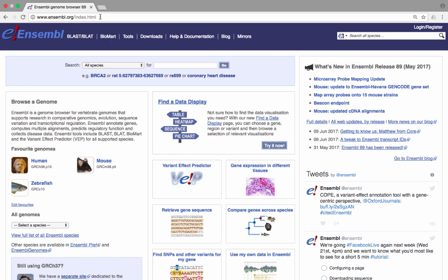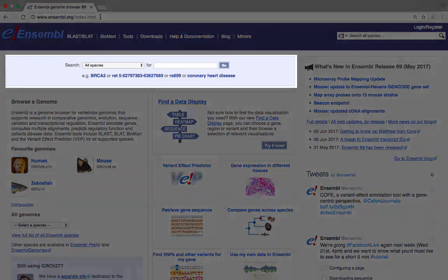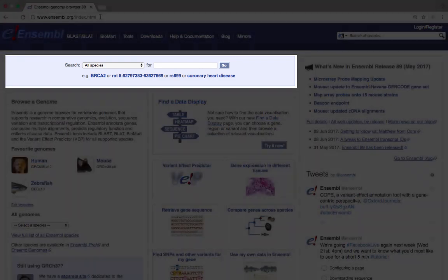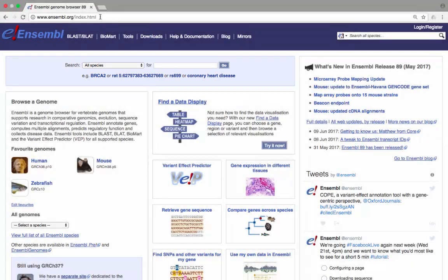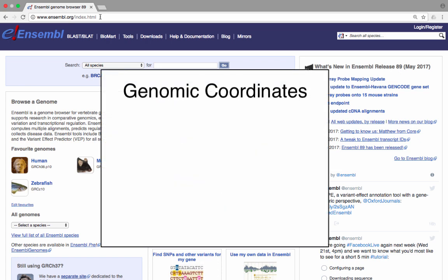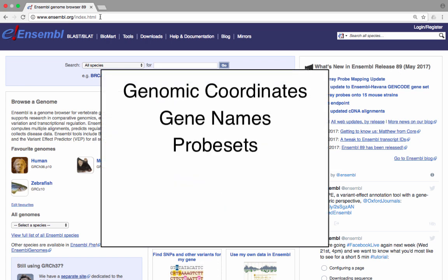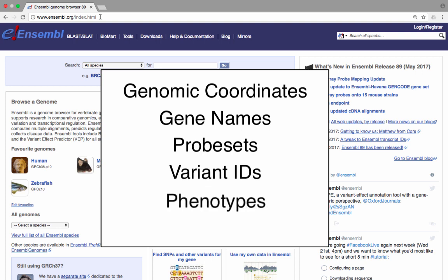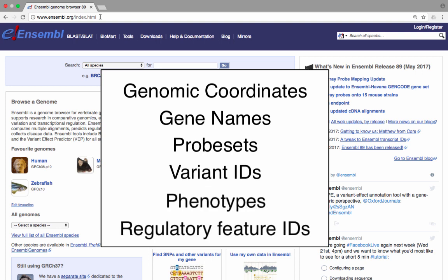There is also a search bar at the top of the homepage that allows you to search all of the species in Ensembl for genomic coordinates, gene names, probe sets, variant IDs, phenotypes, or regulatory feature IDs.